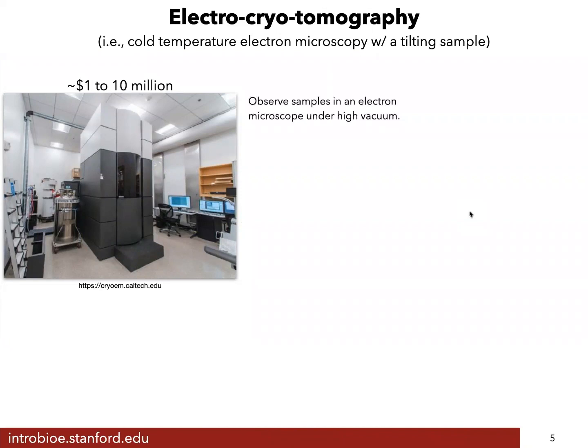We're going to observe a sample using an electron microscope. We'll explain that in a little bit. And the sample is going to have to be in a vacuum, so the electrons in the electron microscope get right to the sample. Now, if I put something in a vacuum and it's alive, how would you do if you were in outer space? If you were in a spaceship and you didn't have a spacesuit on, you just went out of the spaceship and you're in the vacuum, my guess is you already know that you wouldn't do well.